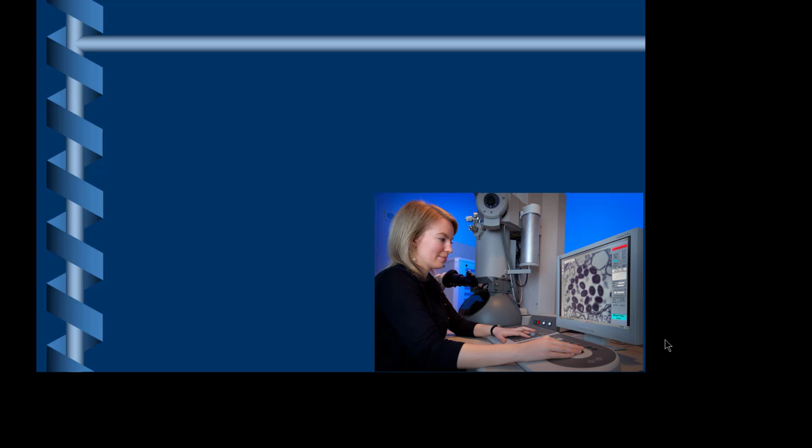Okay, so I told you about the different kinds of light microscopes, and now we need to talk about electron microscopes. There's a huge difference between a light microscope and an electron microscope, but first let's talk about what we gained from creating an electron microscope. We can see bacteria, and you're going to do that tomorrow when you gram stain. We can see bacteria under a light microscope. What can't we see?